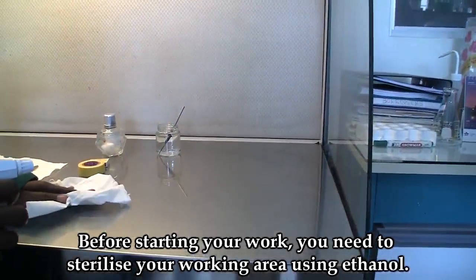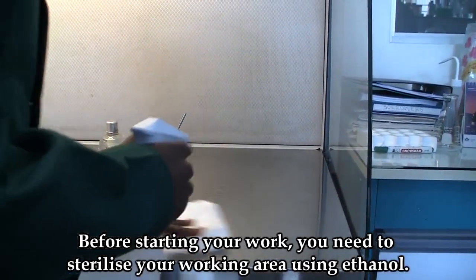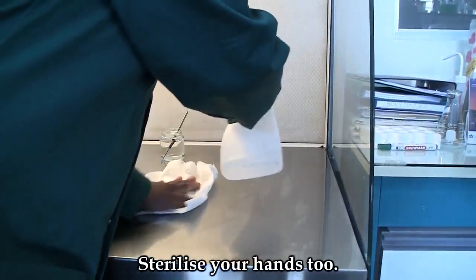Before starting the work, you need to sterilize your working area with ethanol, and sterilize your hands too.